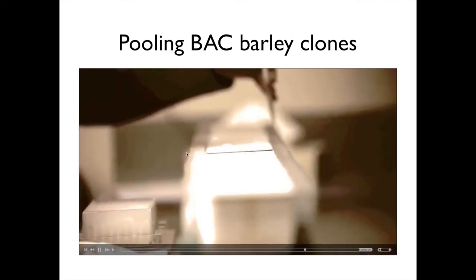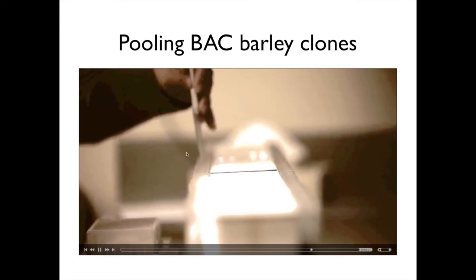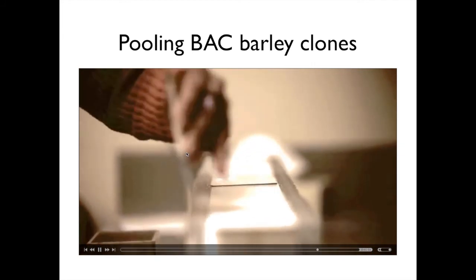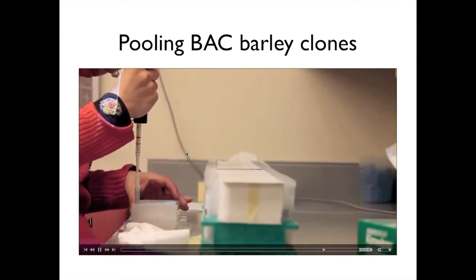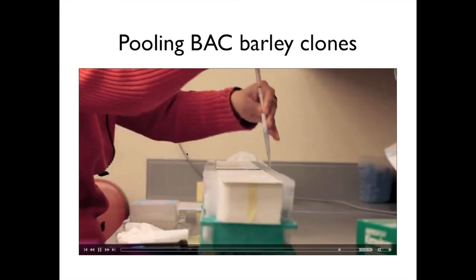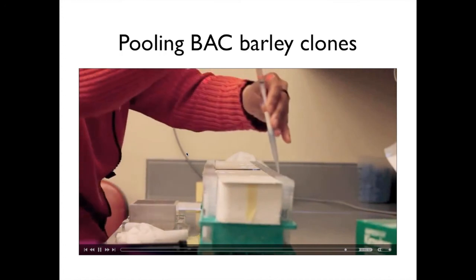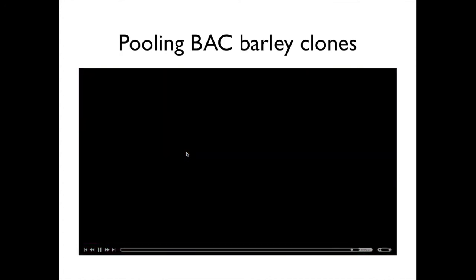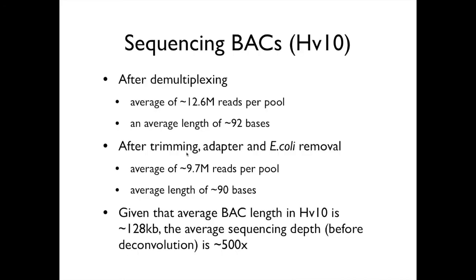And so on and so on throughout the day. It takes roughly six hours to get through one set of 24 plates which would handle 2,197 BACs. So that's sort of a little team party that takes place each time the pooling happens and it's distributing the work. It's actually fairly fun. So now I'll hand you back to Stefano.